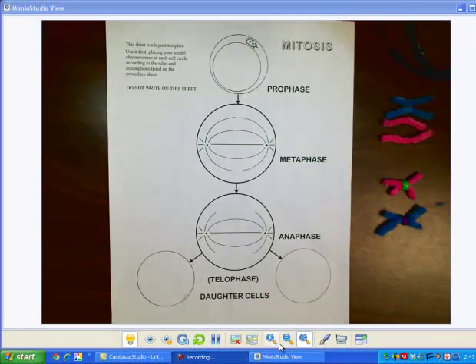Welcome, we're going to do a quick demonstration of mitosis today. For my students, this is the same lab we already completed. I found this lab online and I'm going to show you what everybody saw in lab.